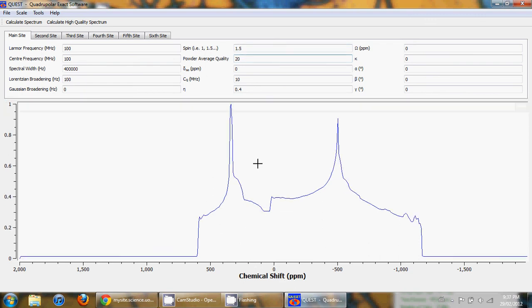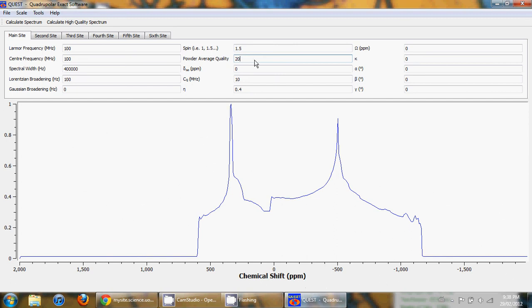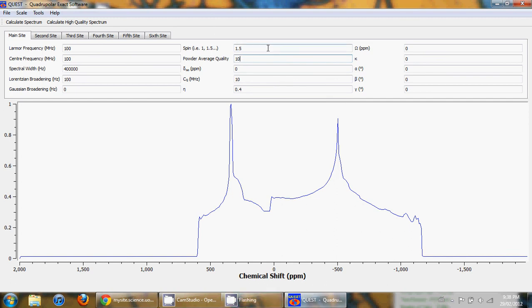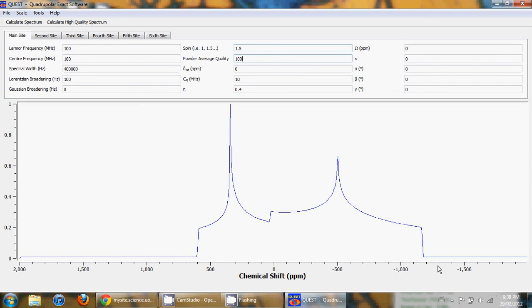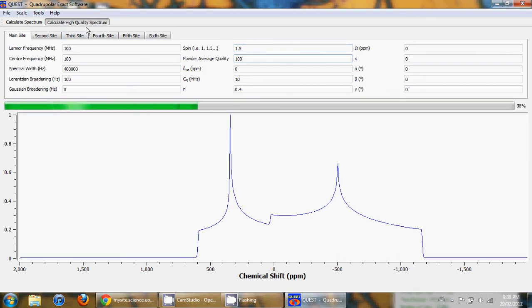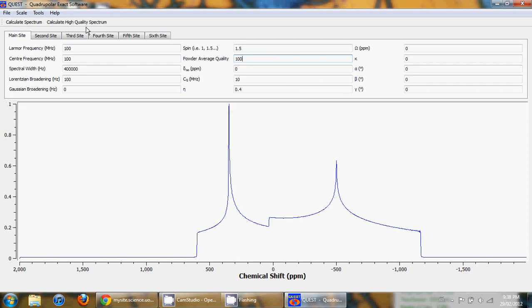But really what this does is it gives you the option to trade off quality for speed when you're fitting your spectra. You can put, for example, a very low powder average quality and get a spectrum which is highly distorted but you still have the right singularities at the right positions. Or you can put a very high powder average quality and get a very smooth NMR line shape. But this of course takes longer to calculate.